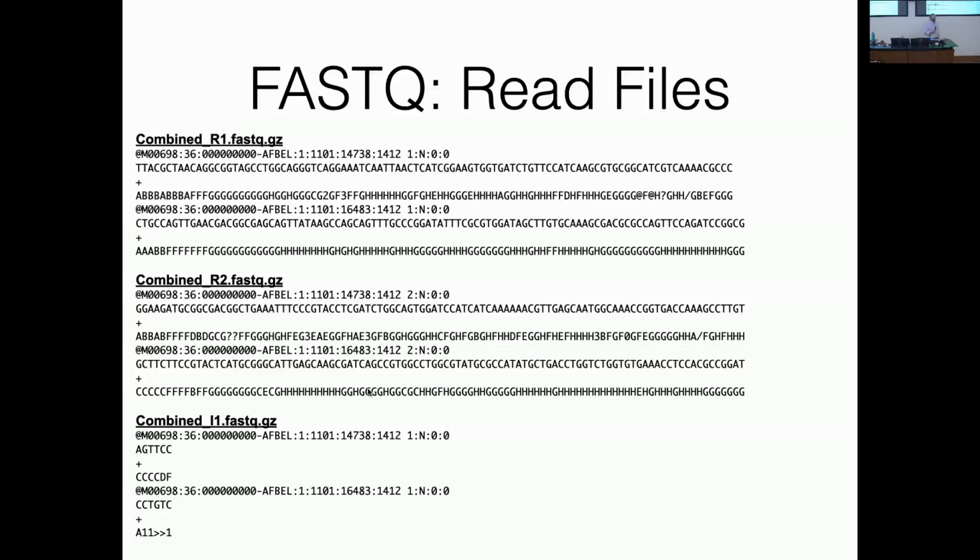And I think if it's a Y, it means that there's some sort of basic level of quality filtering that the machine does. And if it's a Y, it means yes, it didn't pass the quality filtering. I don't know why they made that decision to make N mean good and Y mean bad, but that's what they did. I don't remember what that 0 is, and that 0 has to do with the barcode.